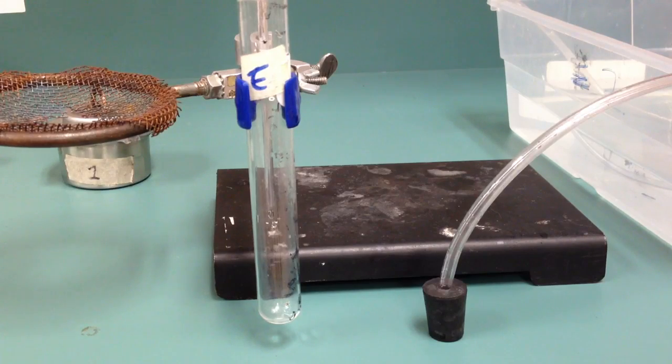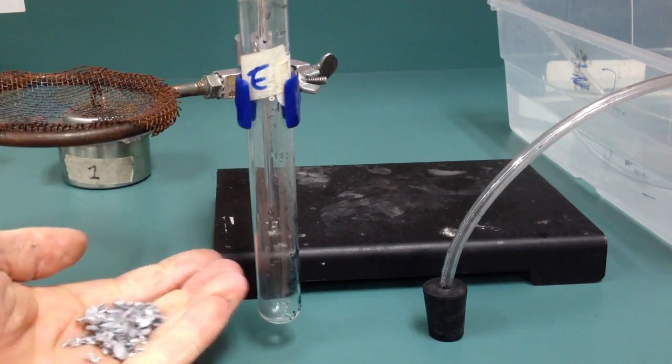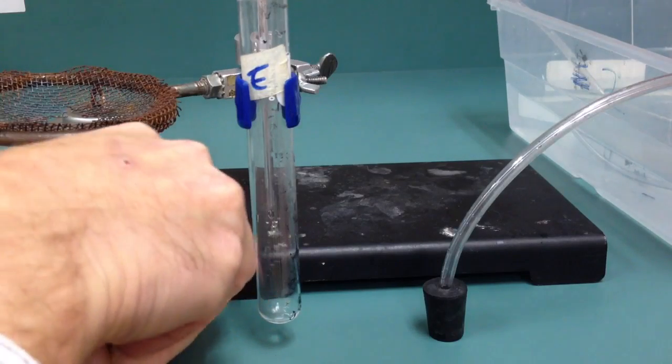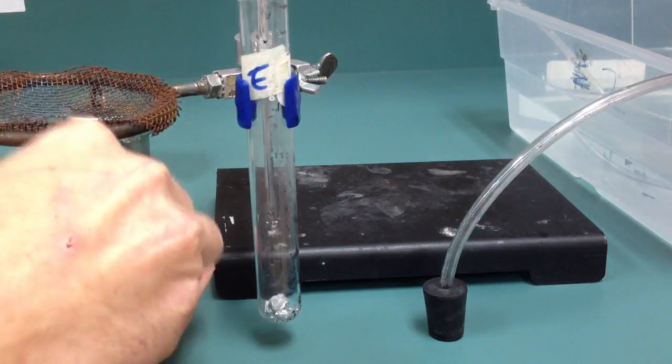Let me grab a little zinc. I have some zinc here. It's just a metal. It's number 30 on the periodic table. And it also would like to get rid of some electrons.